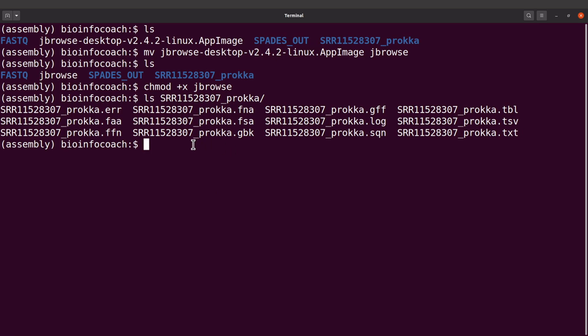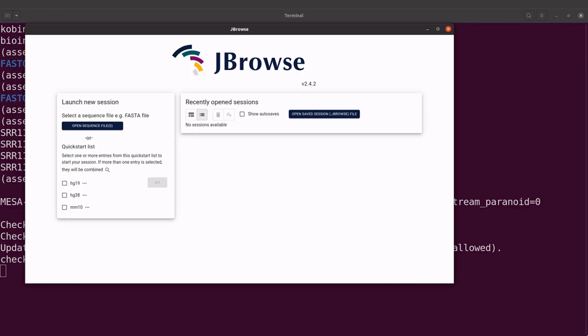So to open JBrowse, I'll say slash JBrowse and then execute the command. Okay, JBrowse has been opened.